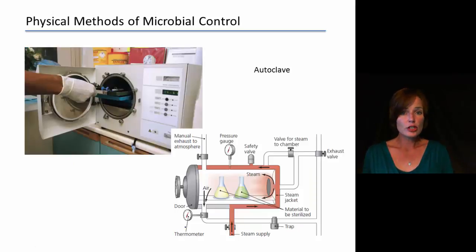So here's just a quick look at an autoclave. When you get down to it, this is like a pressure cooker, but larger in many cases. This is one way that they sterilize many instruments in a medical environment. The instruments are put on a tray perhaps, and then inserted in there.